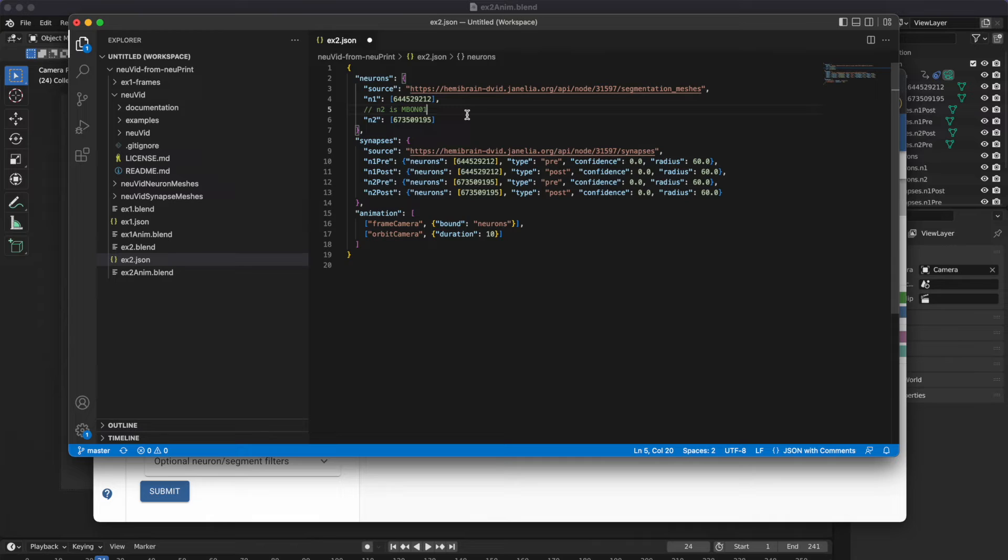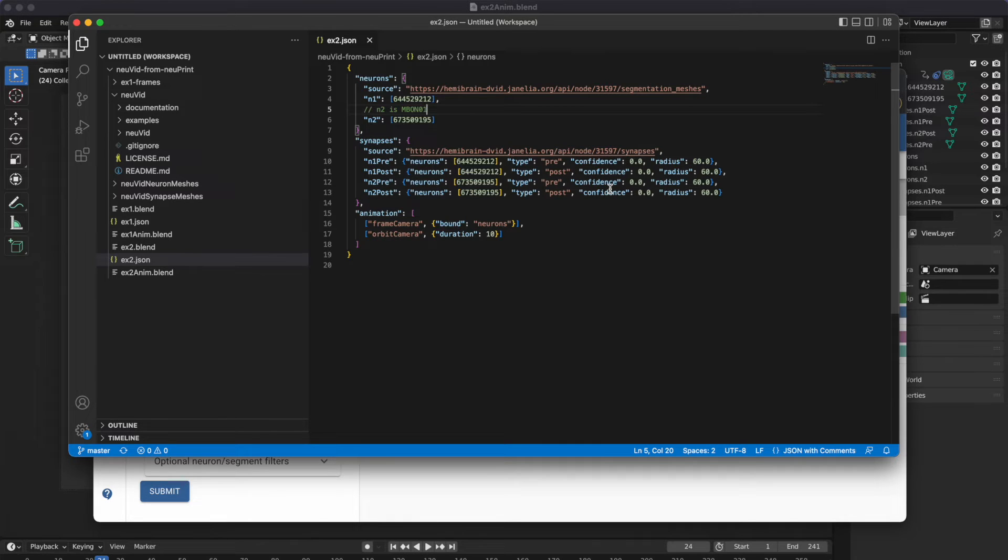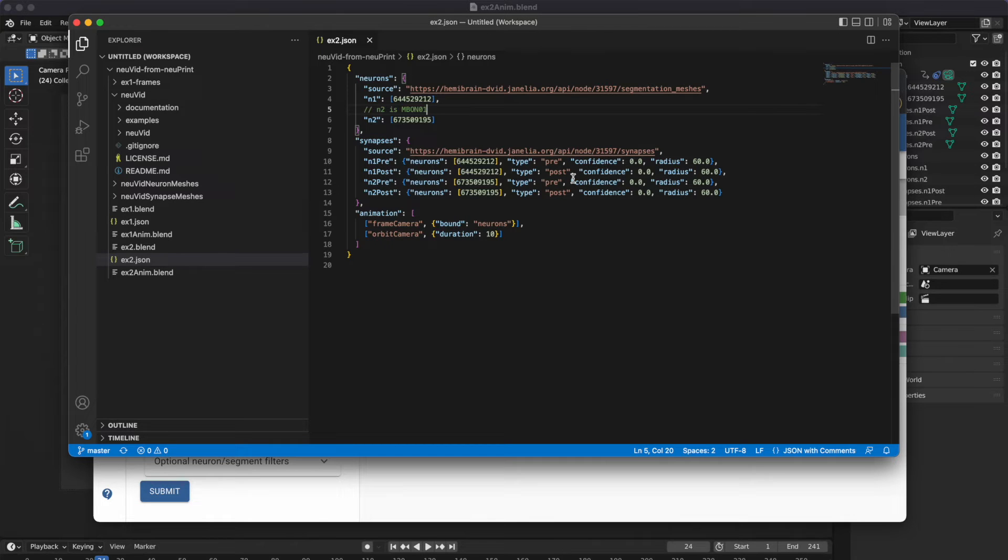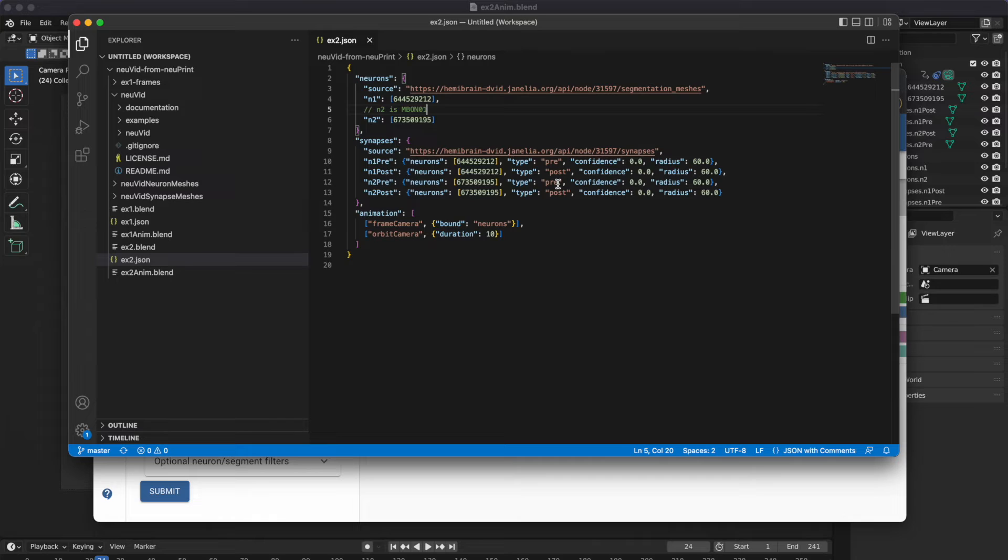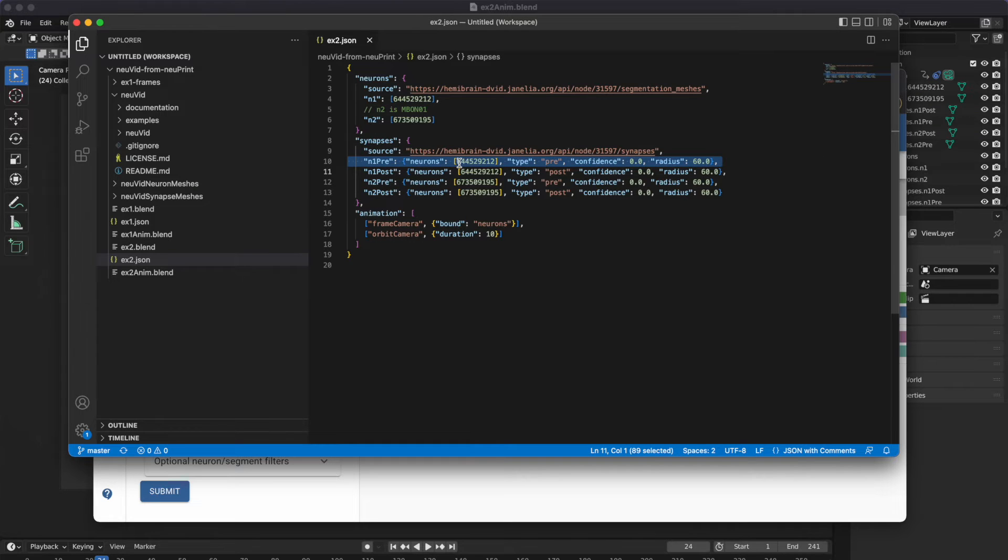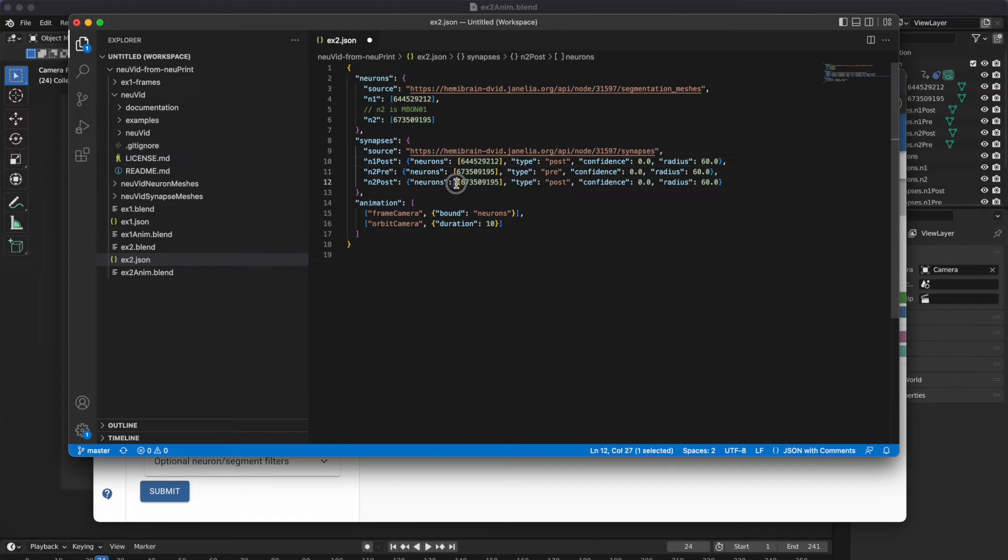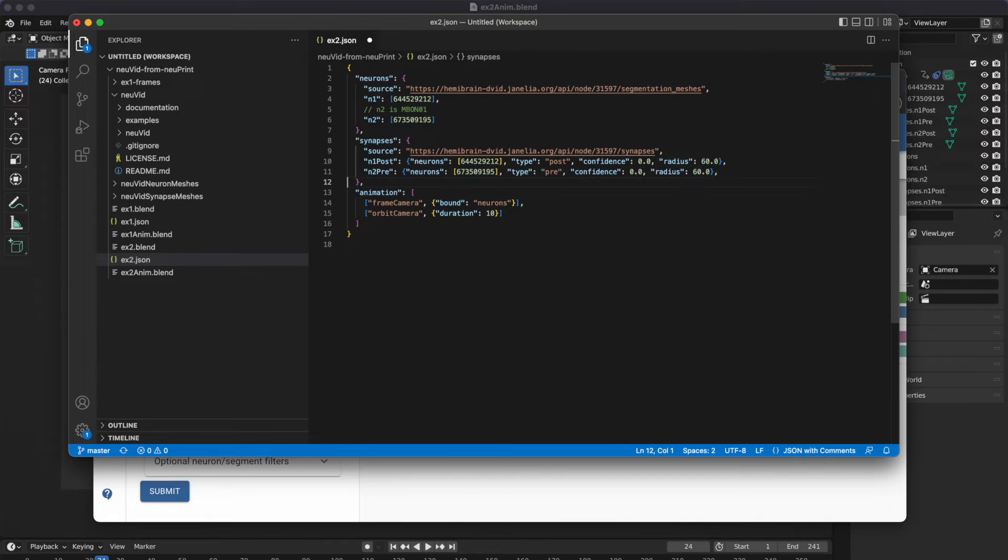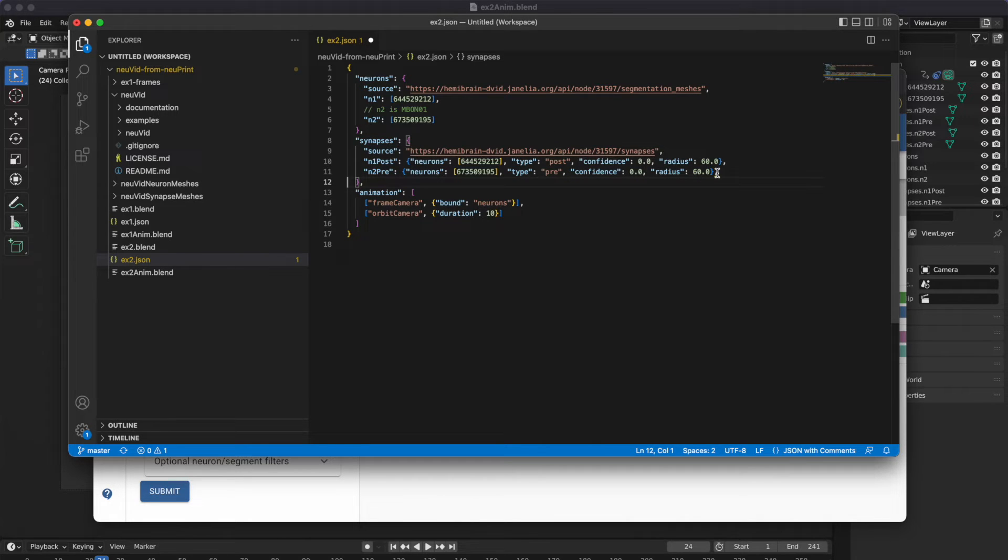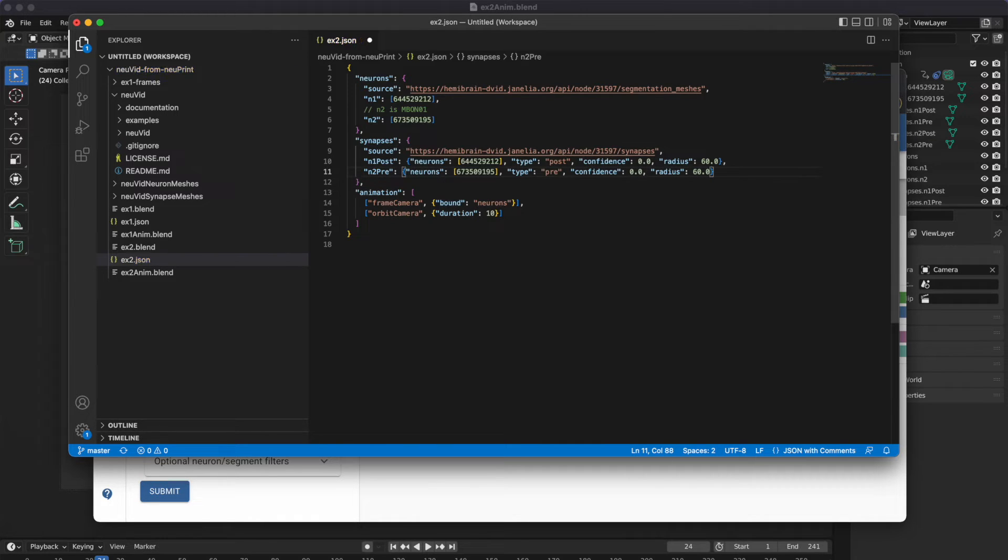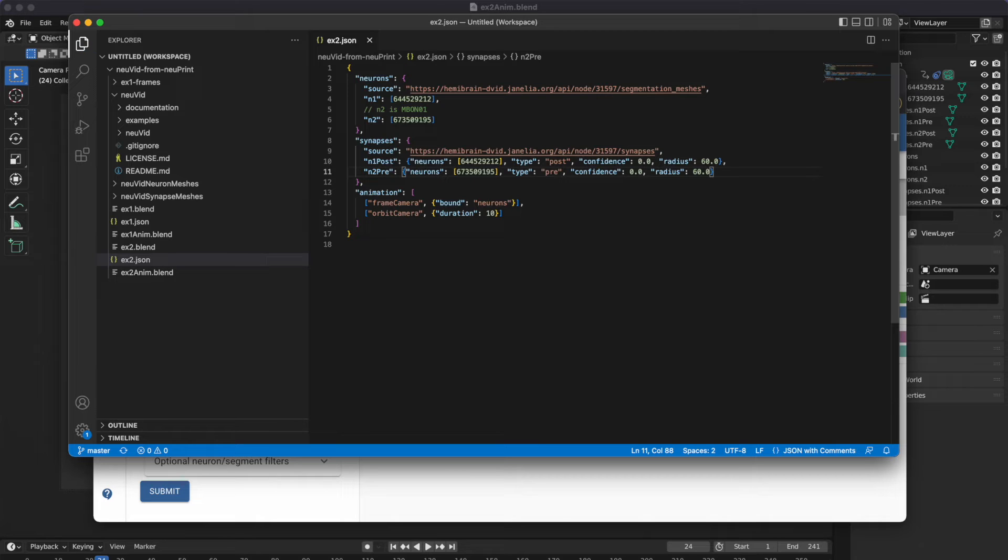Okay, now to reduce the number of synapses we see. We can edit this part in here. We want to have the outputs from the m-bon. So that would be the n2 presynaptic sites. And then the inputs from the other one. That would be the n1 postsynaptic sites. So we want to delete this. And we want to delete this. Now, notice I'm getting a little error here from the trailing comma. With JSON you can't have a comma at the end of a section like that. So just remove that. It's nice that the Visual Studio code tells us about that. So now we've got the synapses set up the way we want.